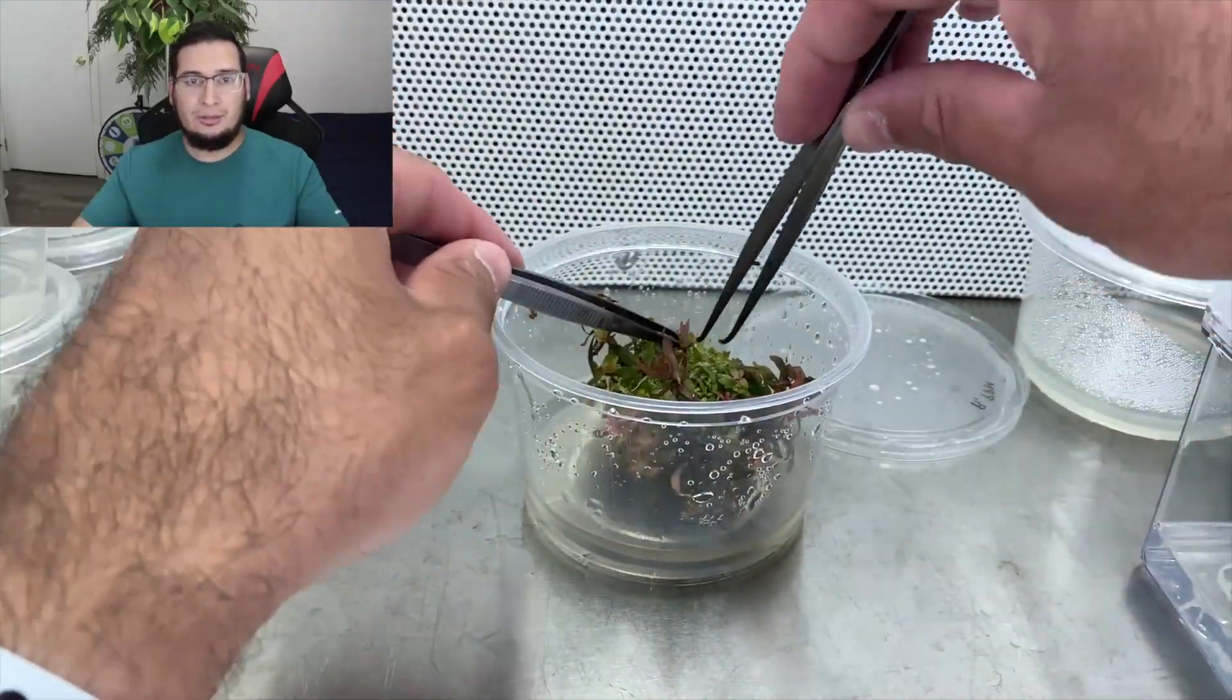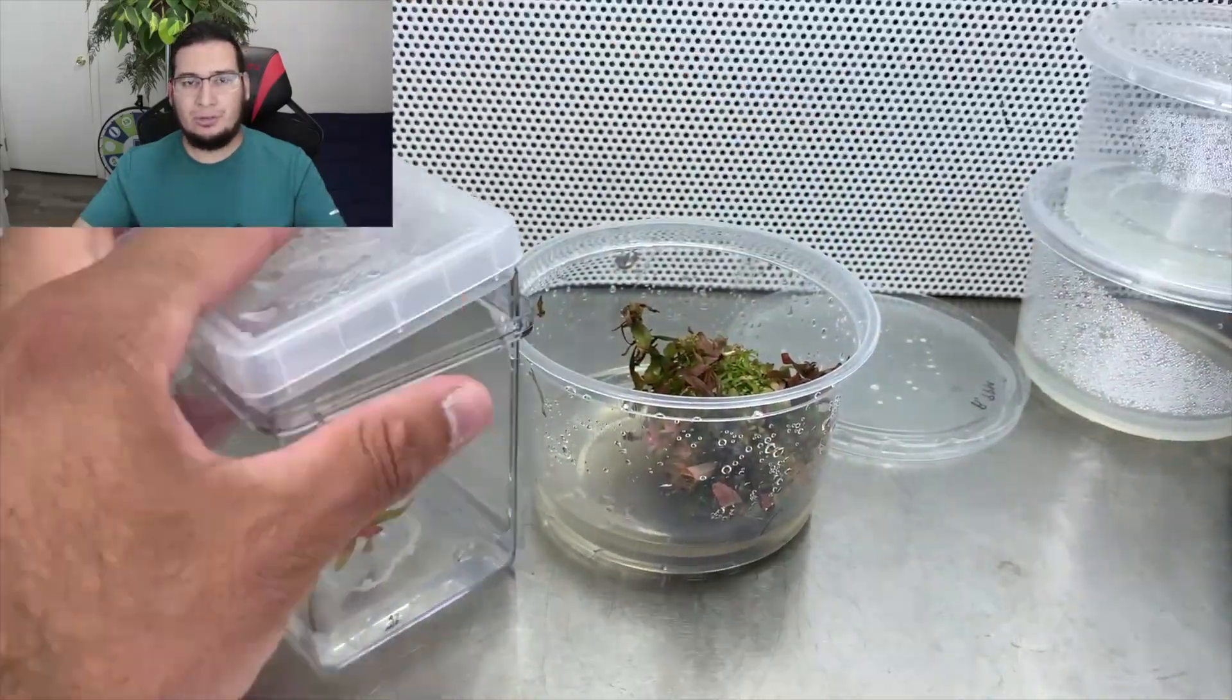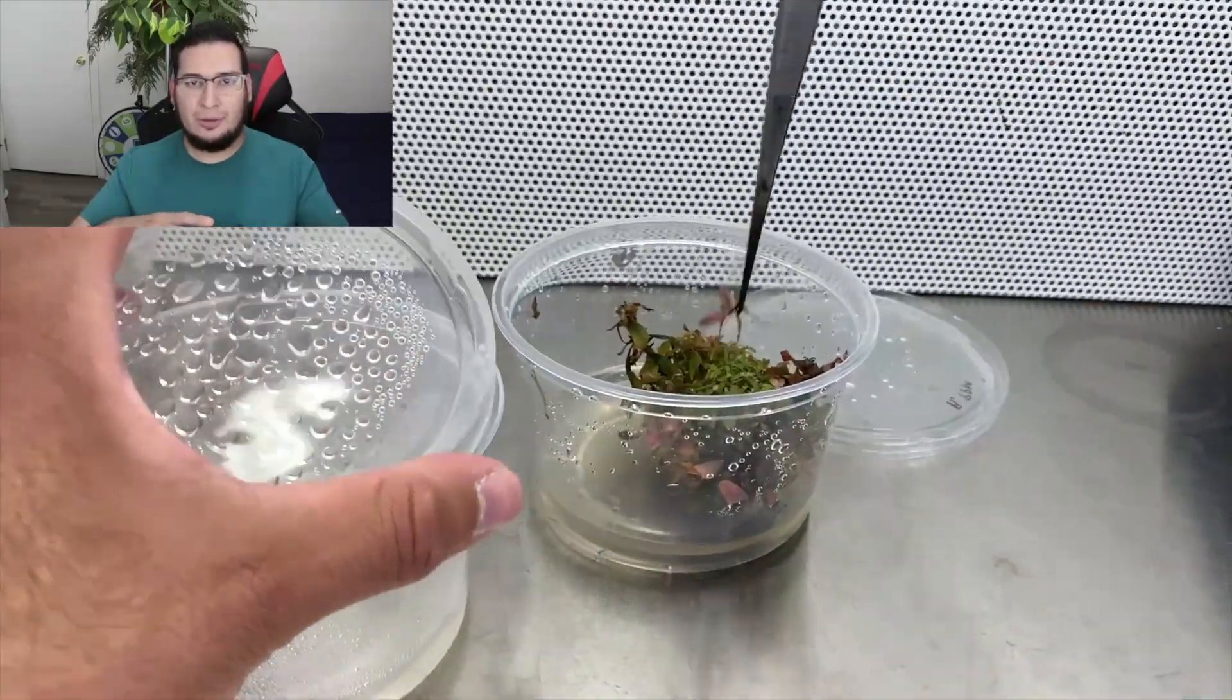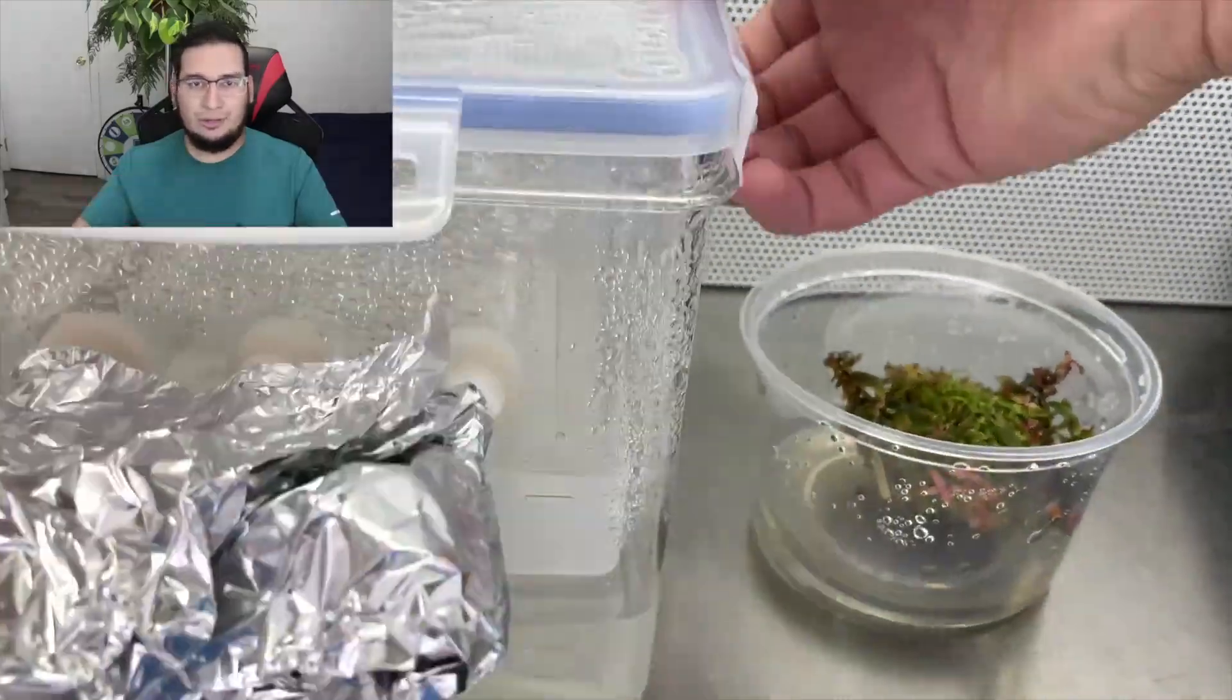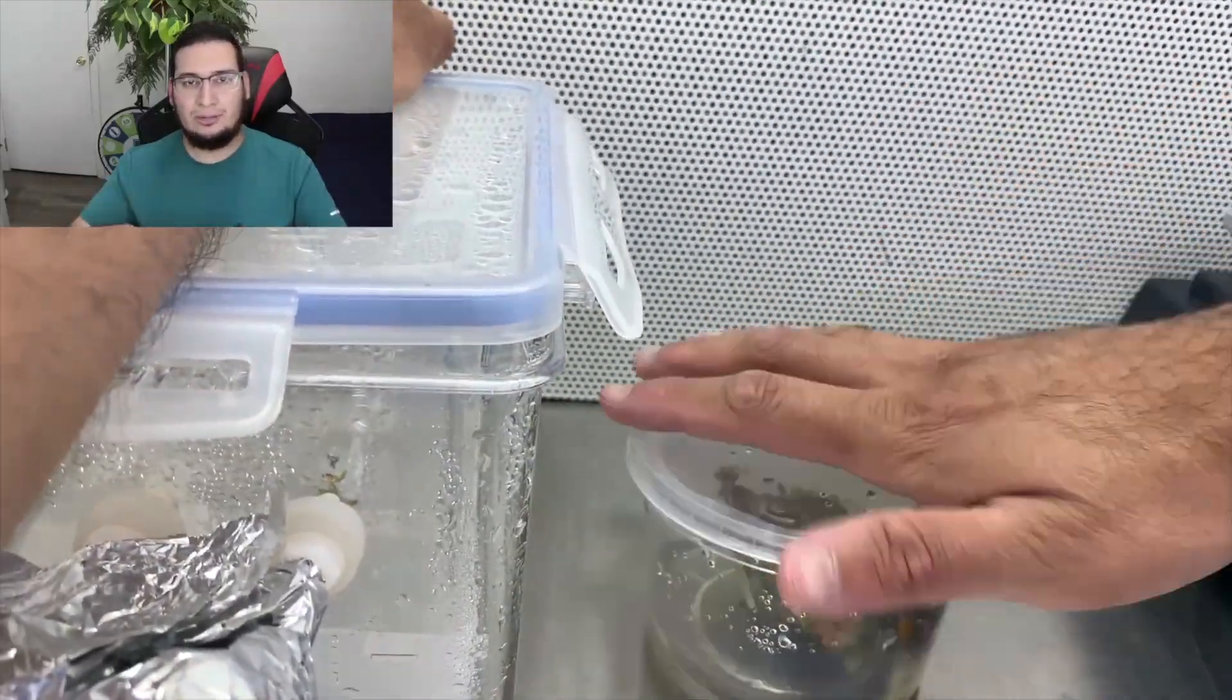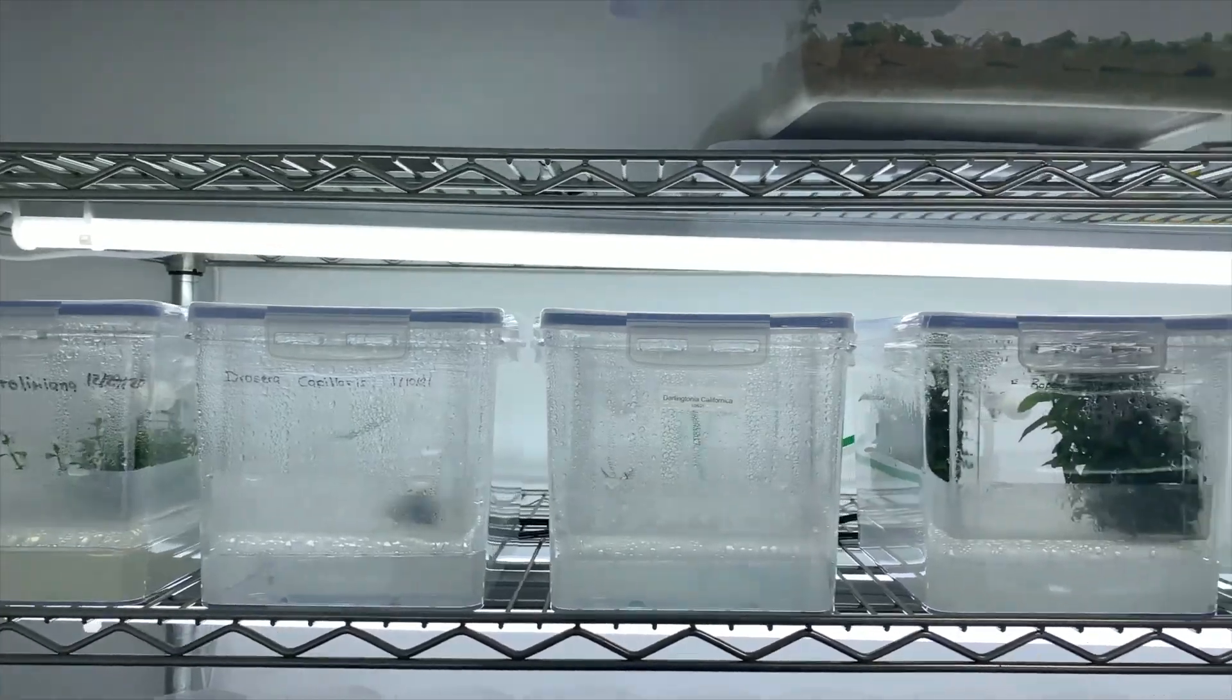In this video I want to show you how the system works. I got an email from a person who was asking me how the temporary immersion bioreactors work, like what kind of pumps I'm using, timers and solenoids and all that kind of stuff. So in this video I want to show you my setup and explain how it works.